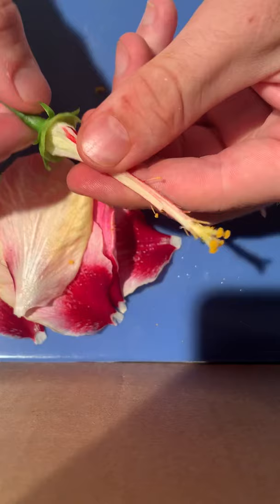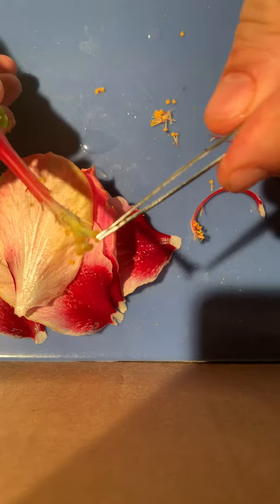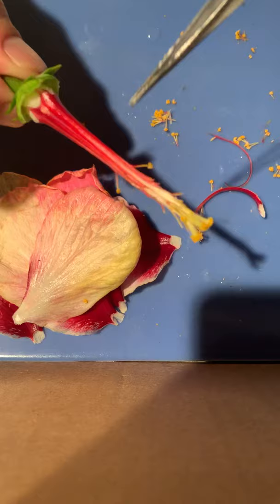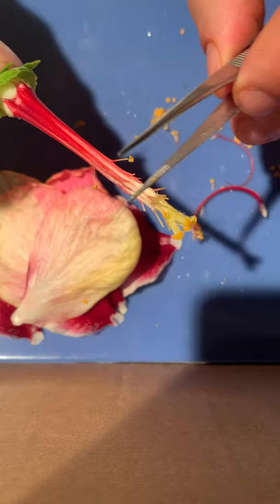Right here is most of the female reproductive structure. This is known as the stigma, and this receptive tip actually traps the pollen inside to bring it to the ovaries. This long portion between the stigma and the ovule is known as the style, and I will cut it open. Inside we could look at the pollen tube where the pollen is actually transported from the stigma into the ovary.